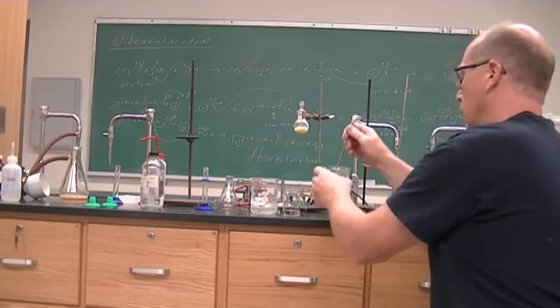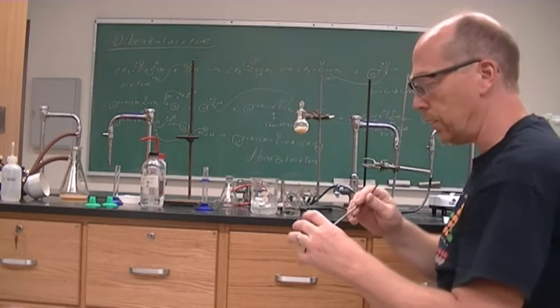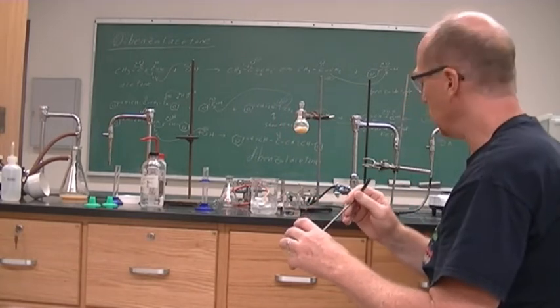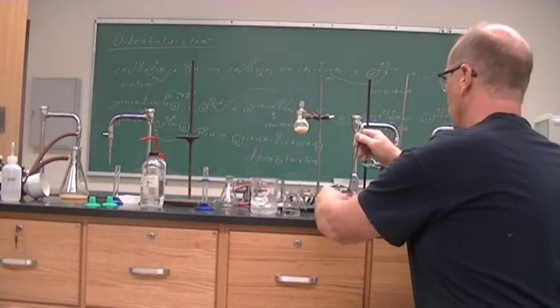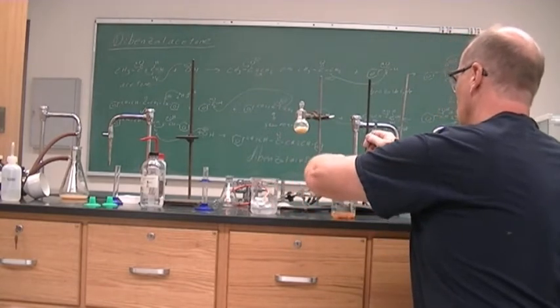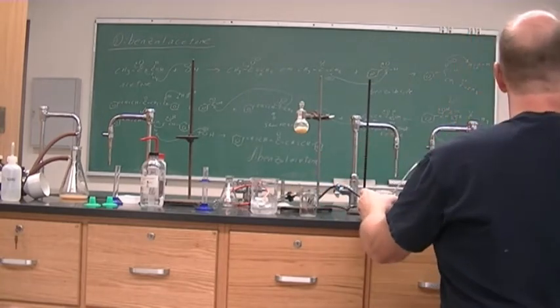the yellow has completely dissolved, like immediately everything that was yellow dissolved. Alright, so the solubility of the yellow product in our ethyl acetate is much higher than our red product, orange product. Alright, so I've added all the ethyl acetate. I'm going to then heat this up and see if we can get it to dissolve.